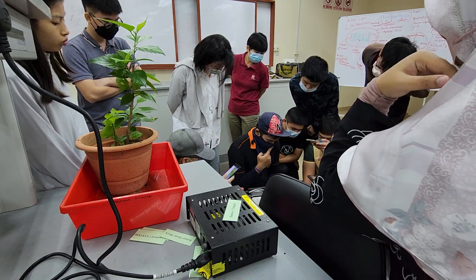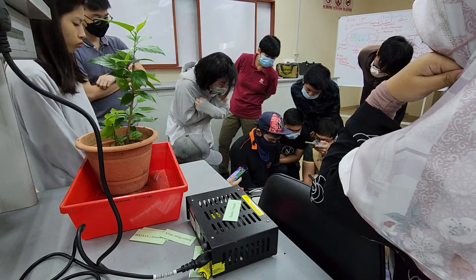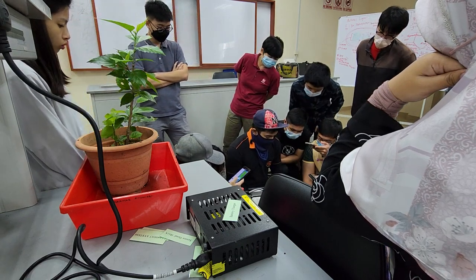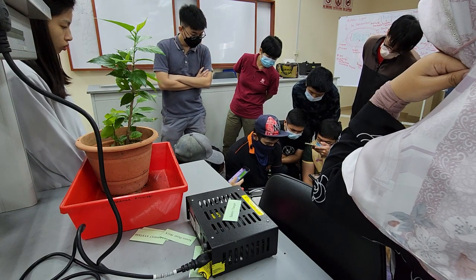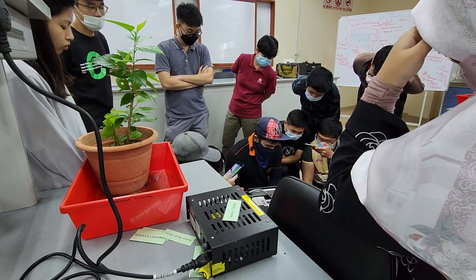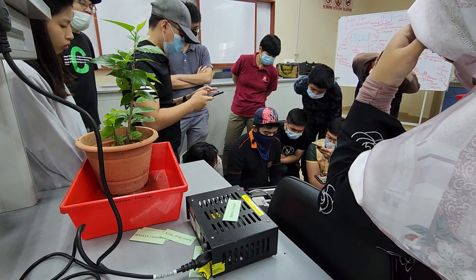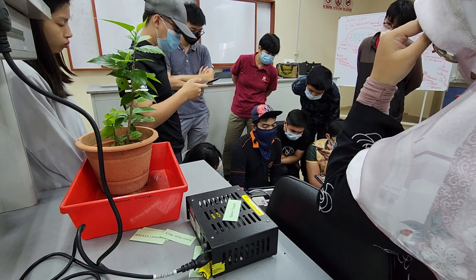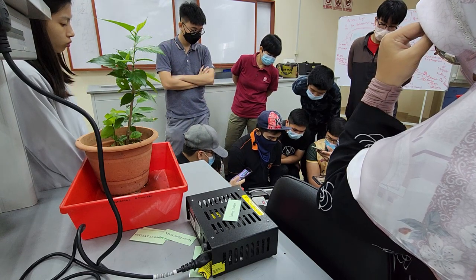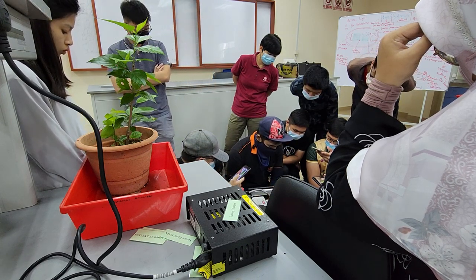Look good? Looks good? Macam tak stable. How do you know? Look at that thing. Negative. Okay, not to worry. Another way to do this is you match the IRGA, which is user matching. So matching, better do when there is no plant in here. You match, meaning that whatever is given by the console should be the same reading by the chamber. So we do the matching. I need to see the standard deviation. So we match the IRGA.